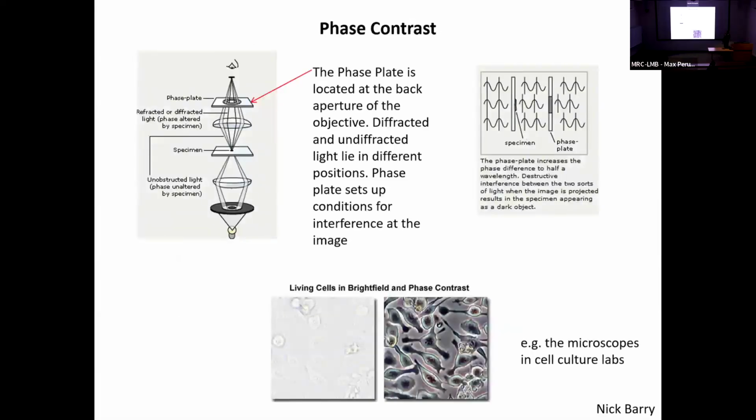So how does it work? Phase contrast, as I said, is a sort of interferometer. I could spend hours getting bogged down in the detail here, but we're just going to go through. The trick is to create an annular light source back down in your illumination part of the microscope in the condenser. So we have a ring of light. That goes through the microscope, the focal plane, and then light carried on through the objective up to the eyeball.